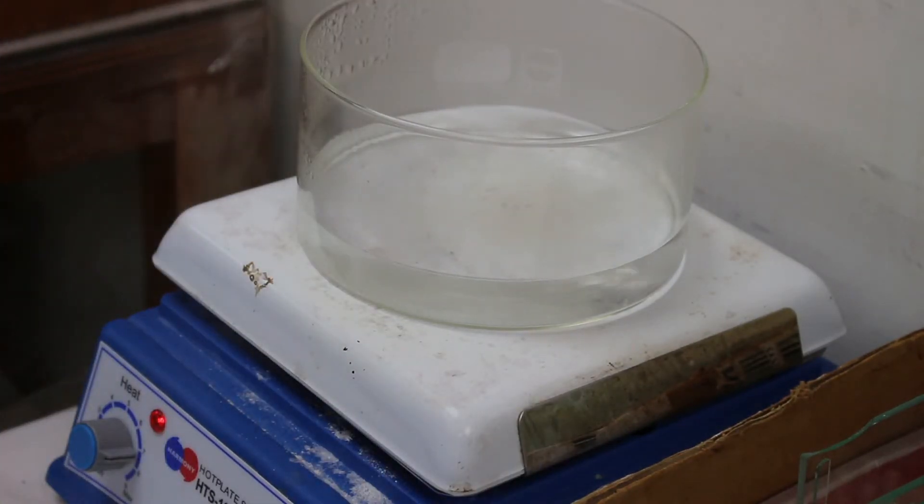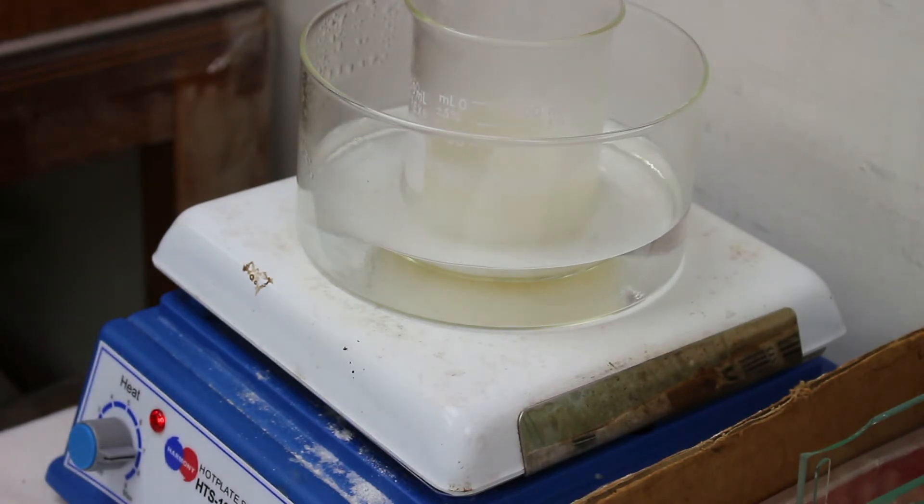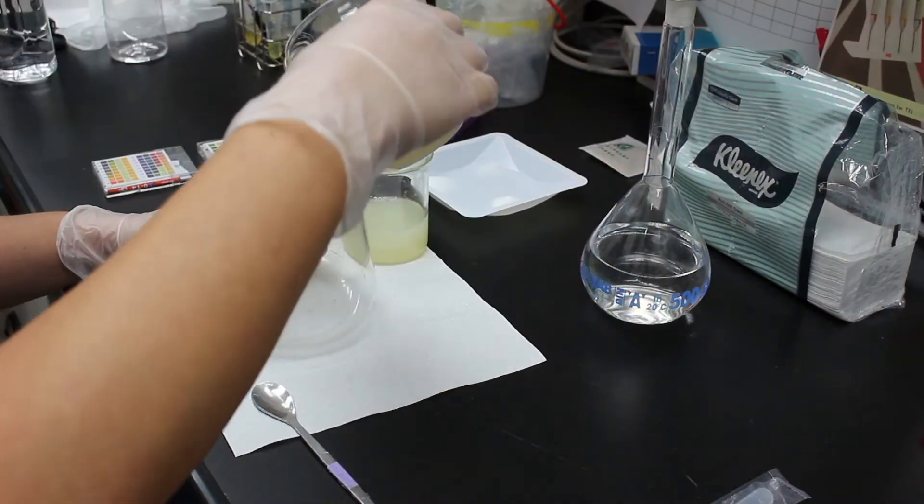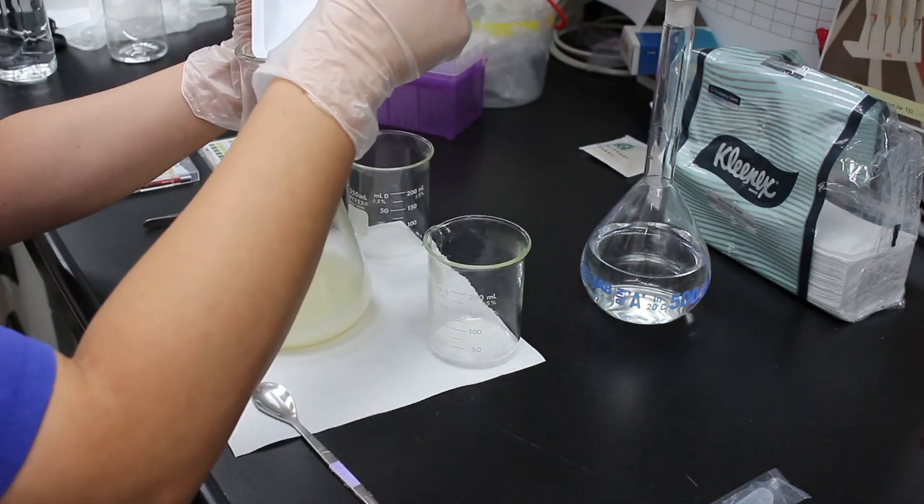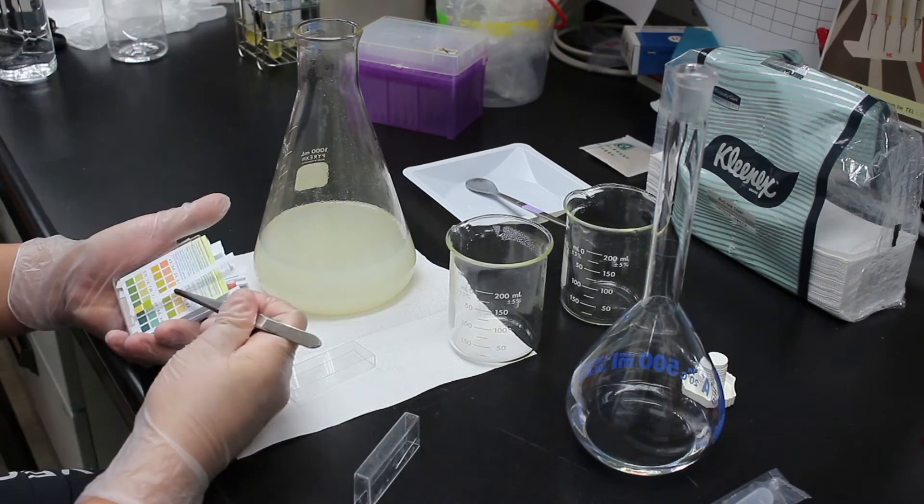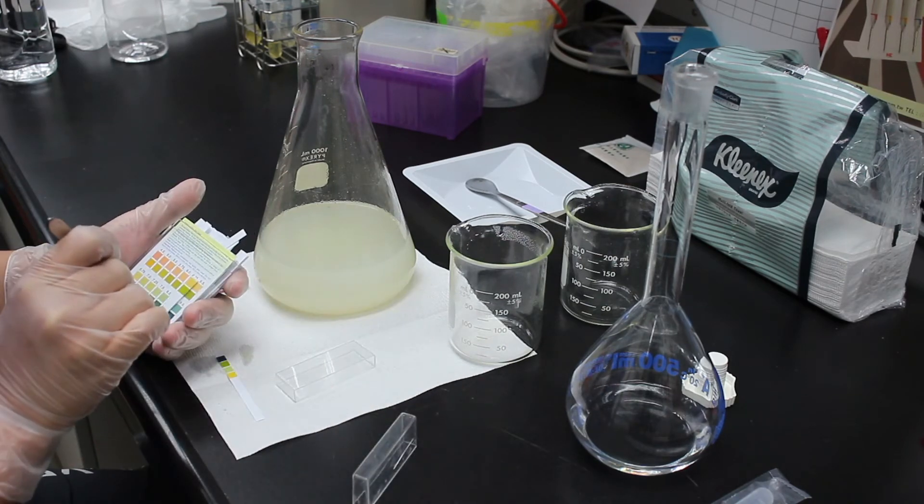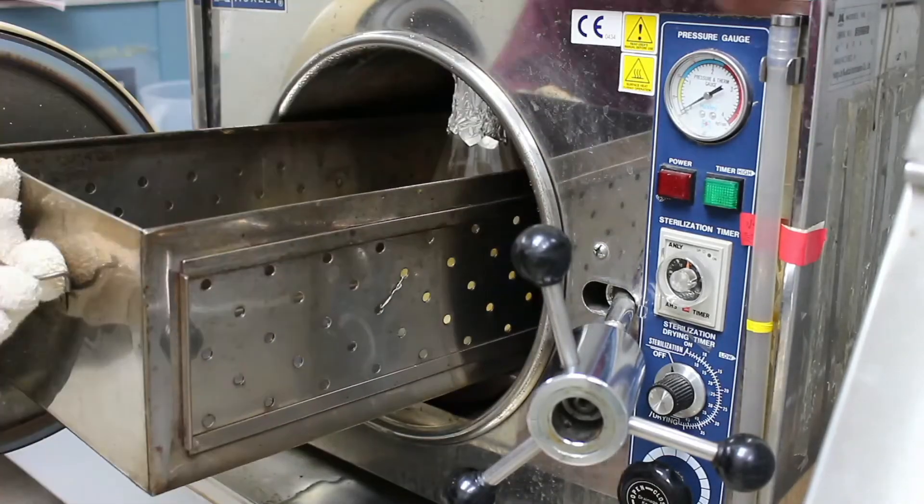When the reaction time reaches what I planned, I heat the solution for 15 minutes to inactivate the enzyme. Then I mix the solution with all the other ingredients and adjust the pH value to around 7.5. After that, all I need to do is autoclave the medium.